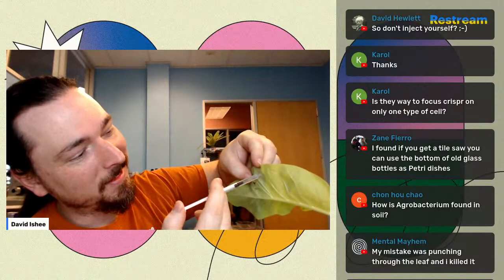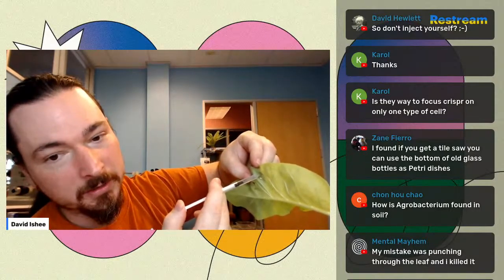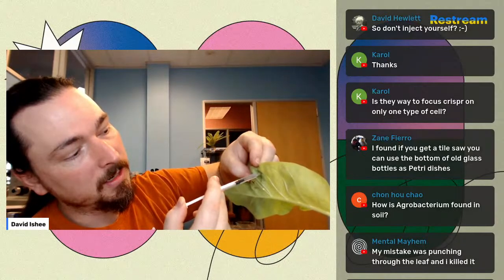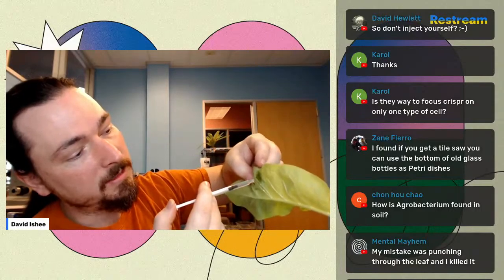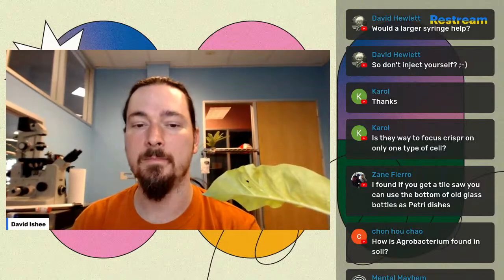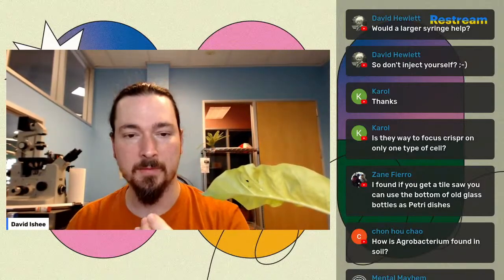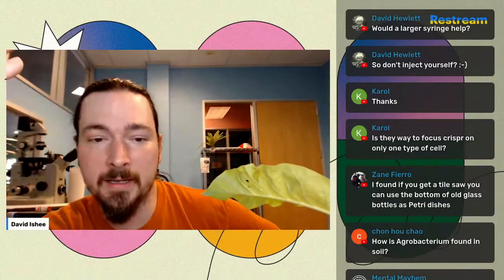So then you just sort of increase the pressure a little bit while you apply steady pressure. And it's more about a nice, long, even, steady pressure. And you want it to just continue to infiltrate into the leaf. Without gloves, it's a little easier to feel the amount of pressure that you're applying, because the glove just deadens your senses a little bit. A larger syringe might help some people.